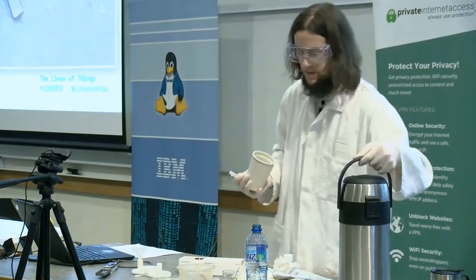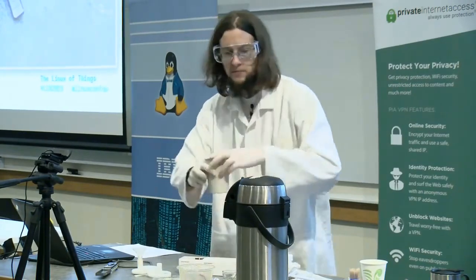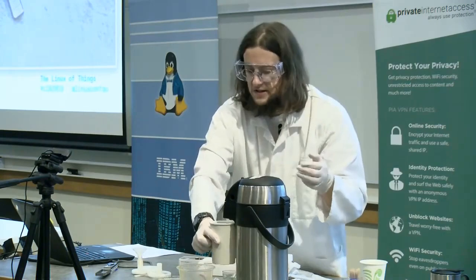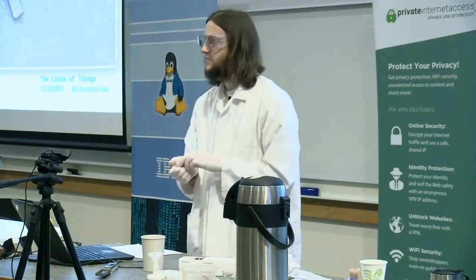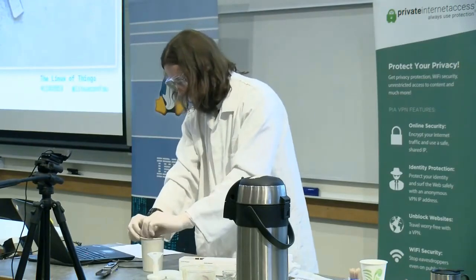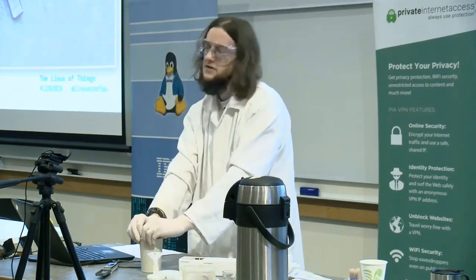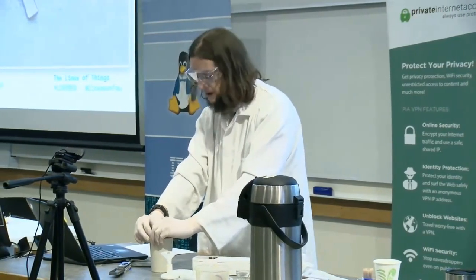So, it just so happens that someone provided me with such a source. I'm hoping that this is about 80 degrees. The purpose of this is to kill the munchy things that I added in a few minutes ago. Now, they need to sit there for another minute. This is to make sure that the fragmentation enzymes are suitably dead and won't give me any funny business later on.